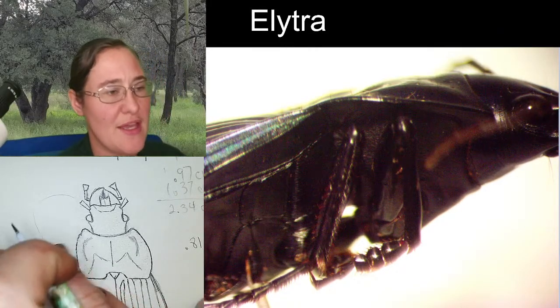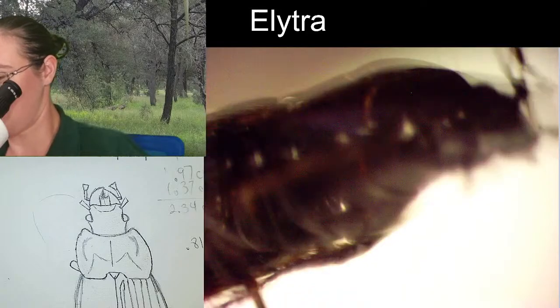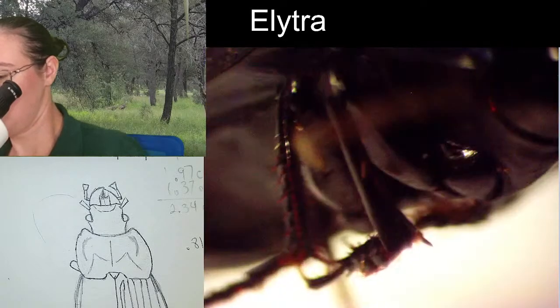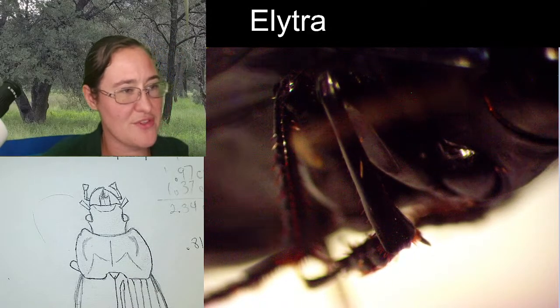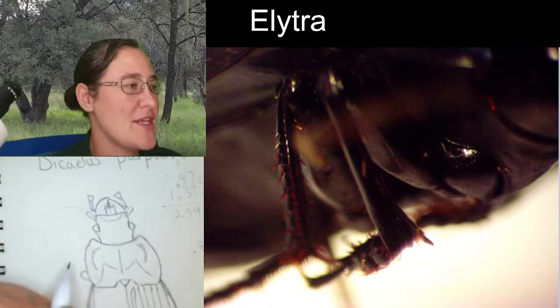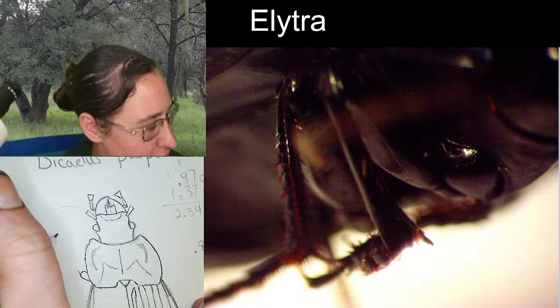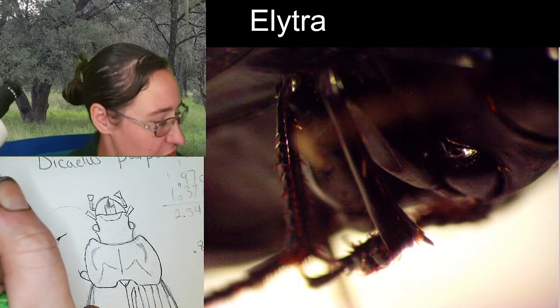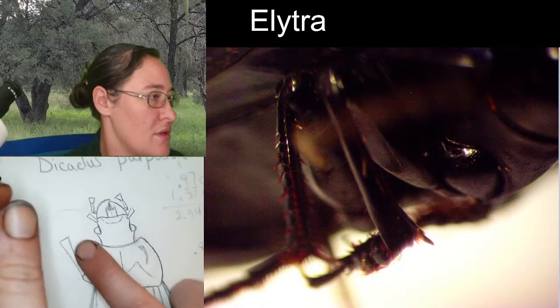The tibia is going to be fairly visible. I really wish, let's see if I look at it from this way. Alright, so that is a view of the tibia. You can see that it does have a tibial spine down there, just the one. That spine is pointed in towards the body. It is narrow and then widens a little bit. The tibia can reach all the way up to about the length of the eye here. Then you've got the spine.